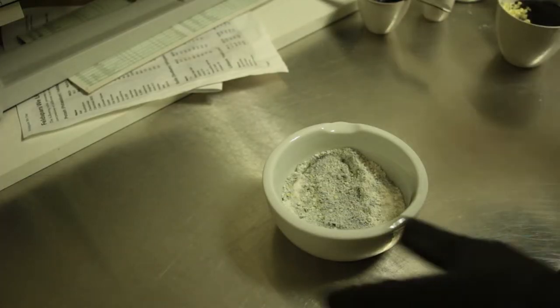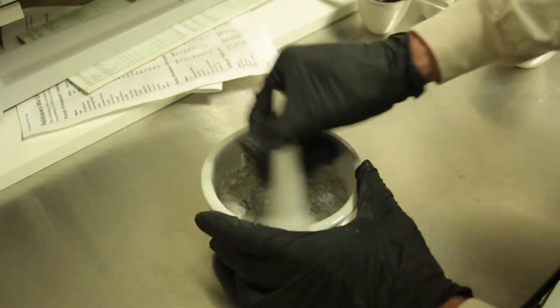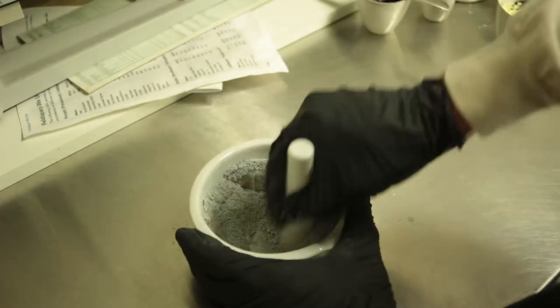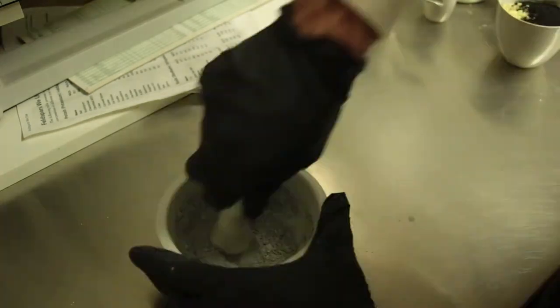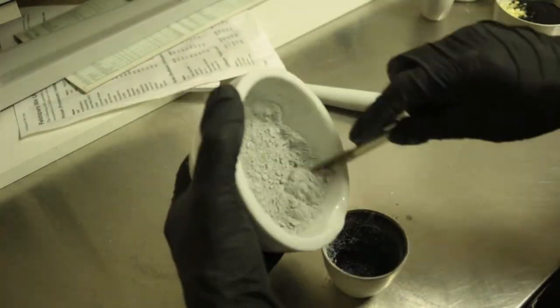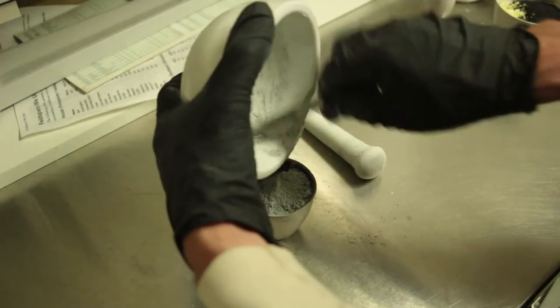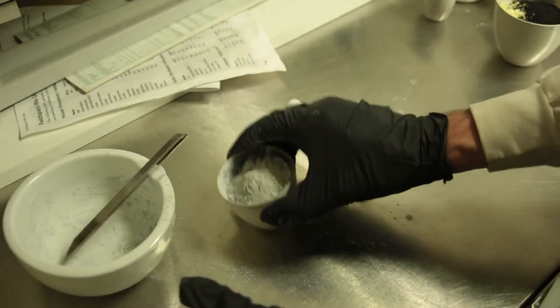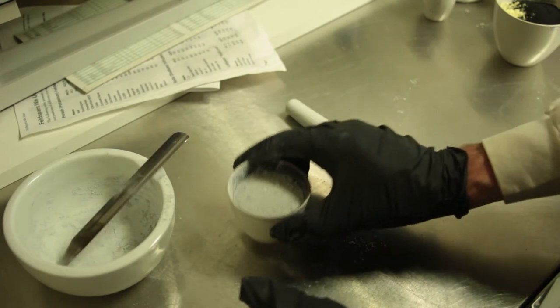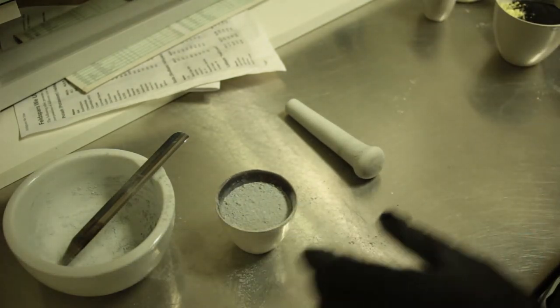I combined these and pulverized them for around 10 minutes per batch to get them fully mixed together, then poured the mixture into the crucible — which was very difficult to clean between runs — tamped it down as in Woodbridge 1949, and tossed on the lid so the carbon could reduce the sulfur to sulfide.